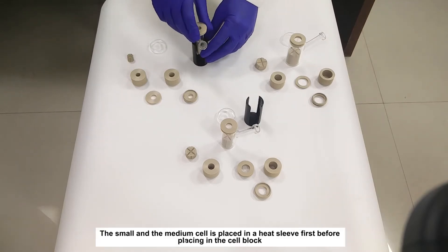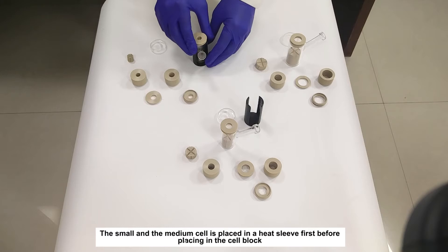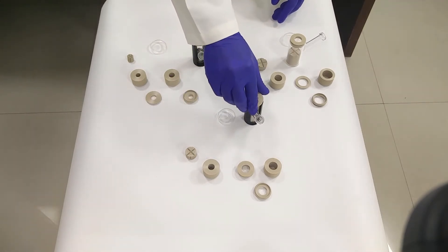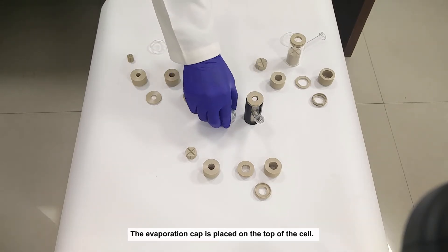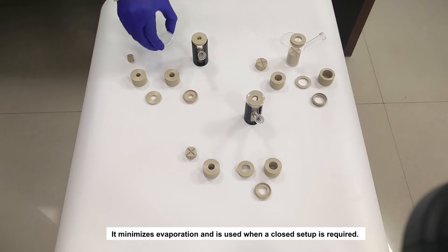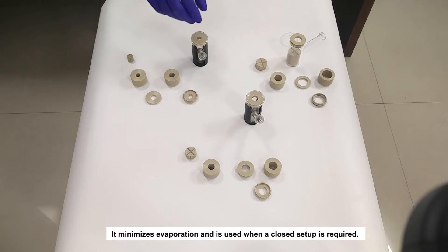The small and the medium cell is placed in a heat sleeve first, before placing in the cell block. The evaporation cap is placed on the top of the cell. It minimizes evaporation and is used when a closed setup is required.